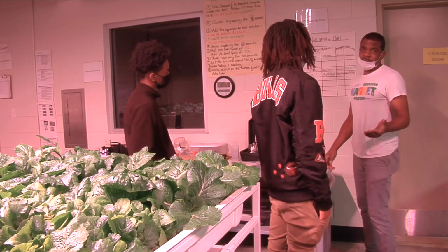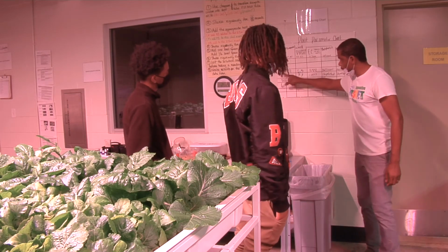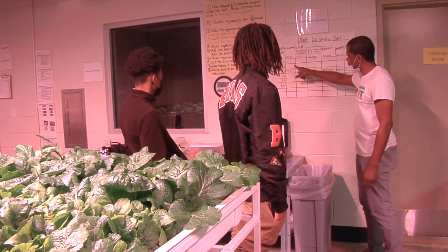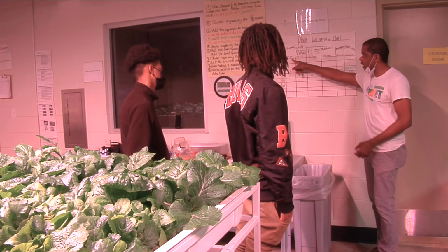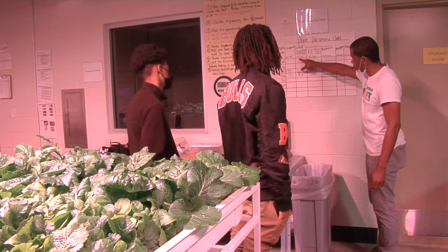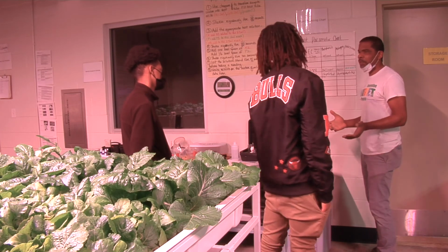Okay, the students just finished their water quality test on grow beds number 3 and number 4. So we're just going to analyze the data. We have 71 degrees. If y'all notice, the temperature range should be between 65 to 85. pH levels. What do y'all notice about tank 4? Look at our range, it's a little high. Do you think that's going to be a problem area?